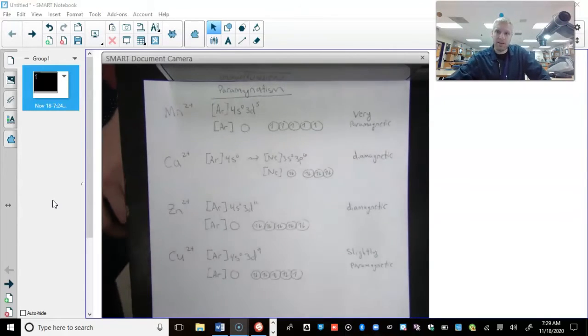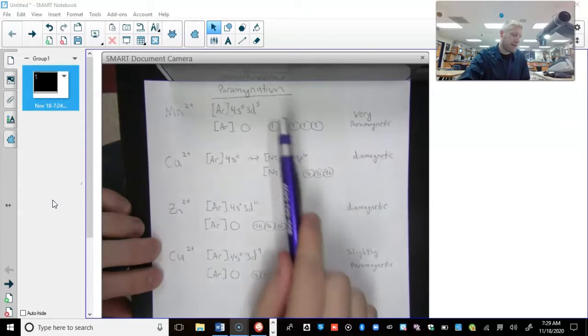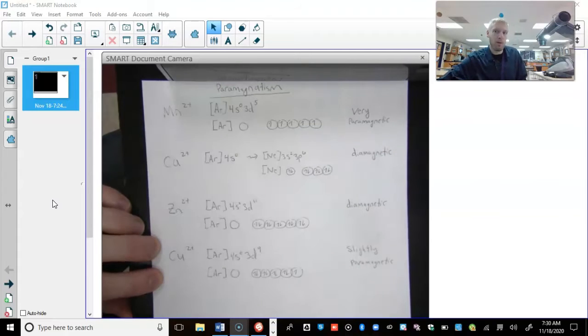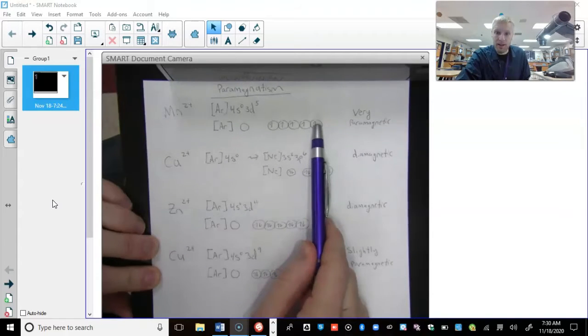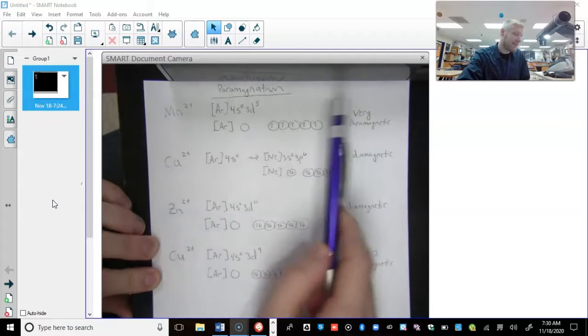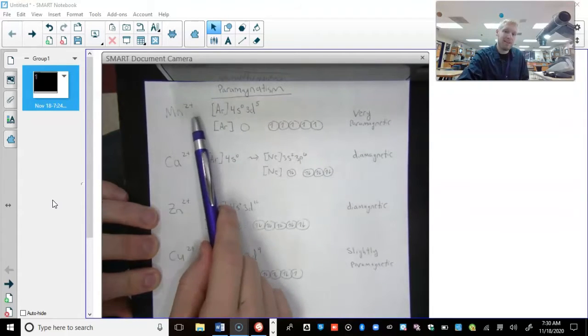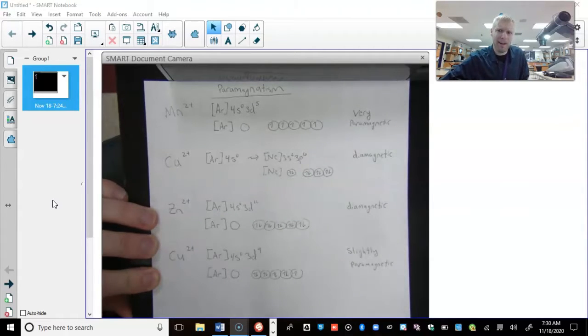Remember, paramagnetism is a slight attraction to a magnetic field based off of the d orbitals and whether they are partially filled or not. So if it is diamagnetic, that means all of the d orbitals would be filled with two electrons. Paramagnetism means that there are going to be a few that are not paired. So we're looking at manganese 2+. Looks like it's going to be one of the most paramagnetic of pretty much any of them, other than iron being paramagnetic.